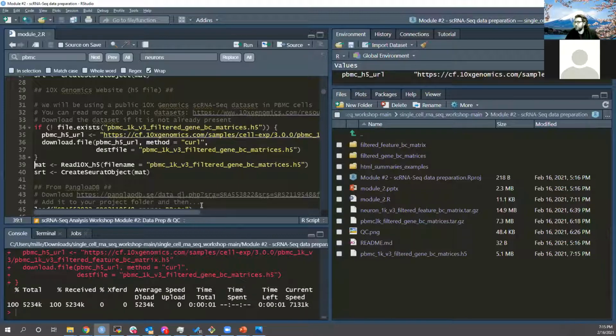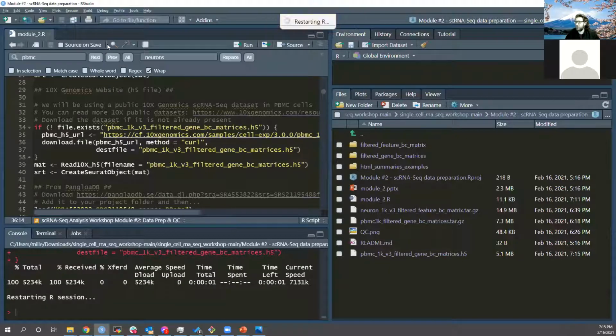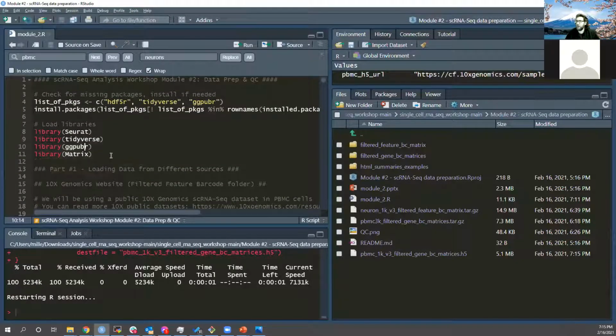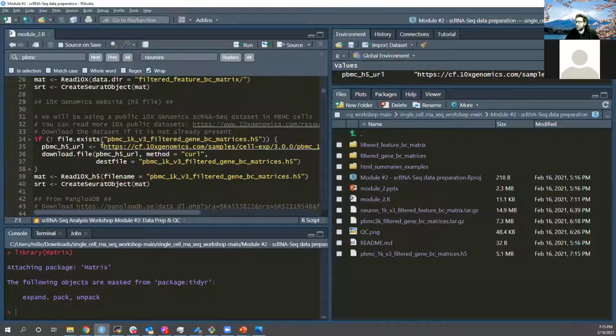All right, my R session is starting to slow down on me. All right, I'm going to refresh my R session in one second. This is something you might want to do periodically because R will over time slow down for reasons I don't entirely understand. The longer you use it or the more of something you try to do with it, it might slow down.